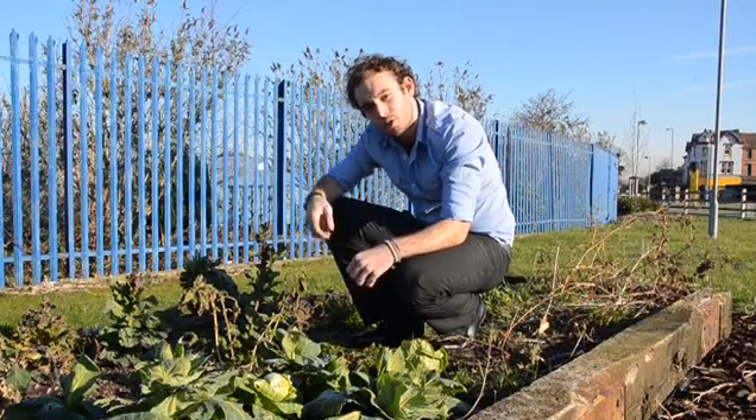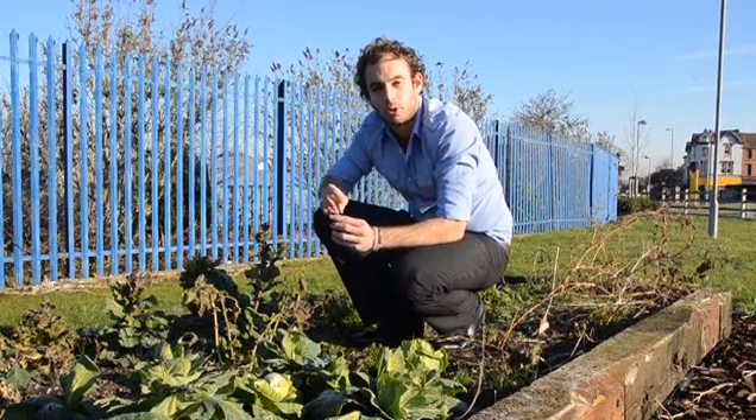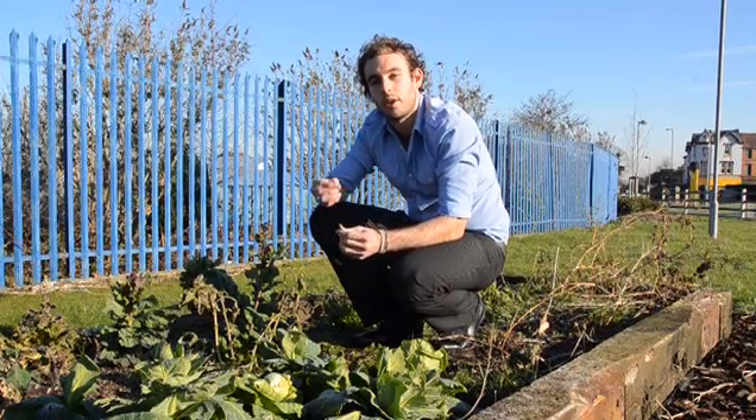Water is transported from the roots in the soil to the leaves of a plant through a special tubule called the xylem. This water is eventually lost through a similar process to evaporation, known as transpiration. With this experiment we will be able to determine the water uptake of a leafy shoot and eventually the rate of transpiration.